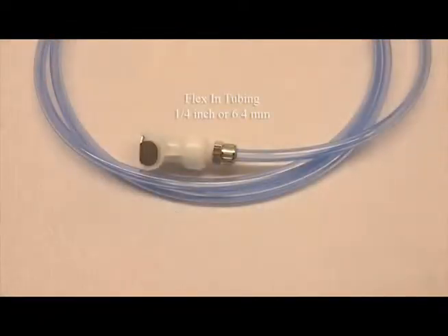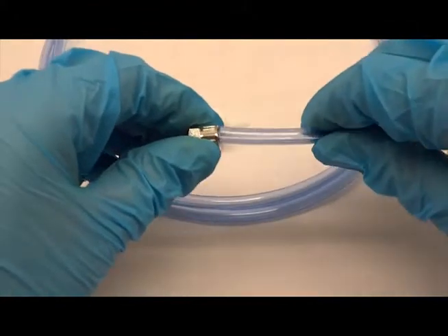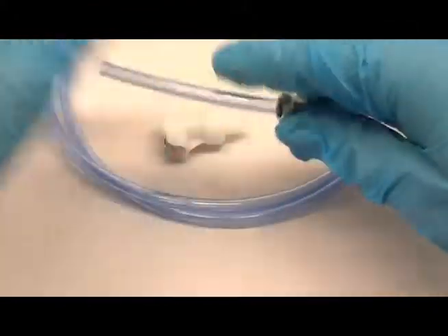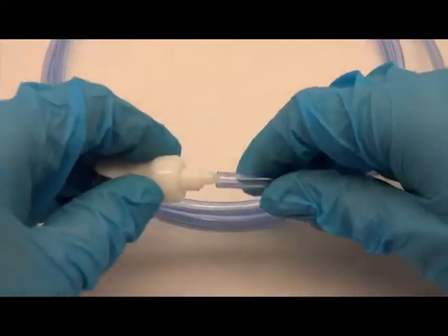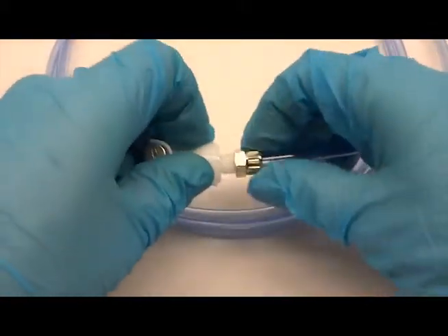For the flex in tubing, use the blue 1/4 inch or 6.4 millimeter tubing and attach the supplied female quick disconnect. Remove the silver nut and slide it onto the tubing. Insert the tubing onto the barb of the quick disconnect until it is completely inside the tubing. Reconnect the silver nut by hand.